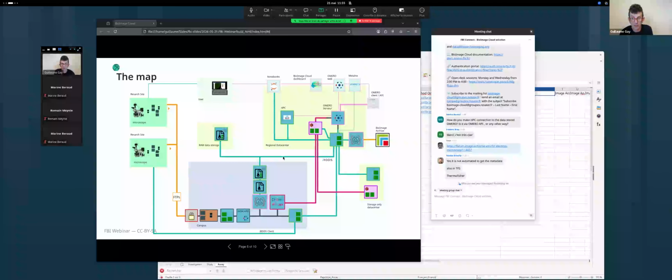So if your data doesn't fit in OMERO because it's not correctly maintained or correctly interpreted by Bio-Formats, it's not exactly the problem, because we can always export the images by themselves in TIFF, for example, or something else.